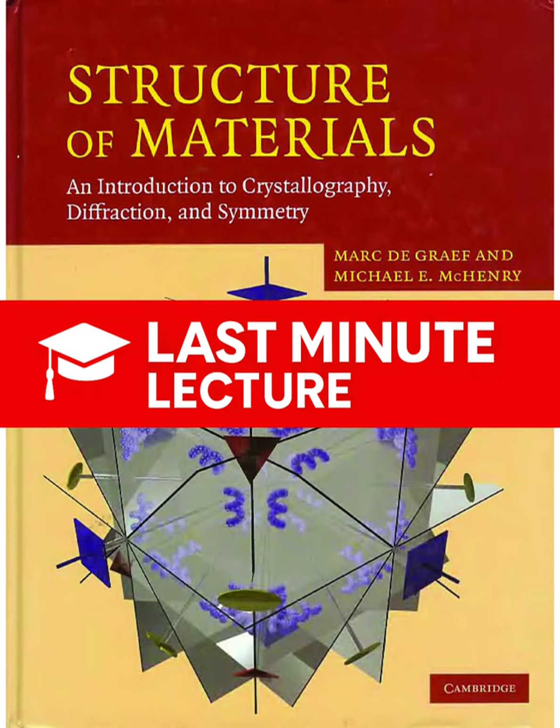Why that specific ratio? Think of it like a perfect bounce off a mirror. If the reflecting plane in the crystal rotates by, say, 10 degrees relative to the beam, the reflection angle changes by 20 degrees. The detector must follow that 2 theta path to capture the signal. This linkage ensures that all the diffracted beams converge exactly at the detector slit, maximizing intensity. And as this measurement proceeds, the detector sweeps across a range of 2 theta values, plotting intensity versus angle. Exactly. And every time a specific set of planes in one of the oriented grains satisfies Bragg's law, we record a sharp peak. The resulting pattern is a unique fingerprint of the material.